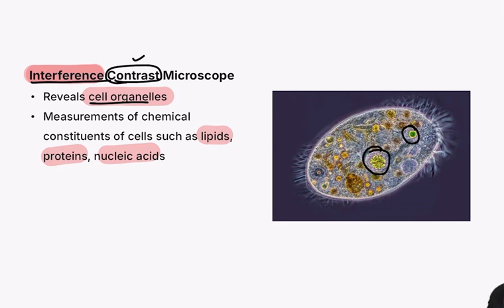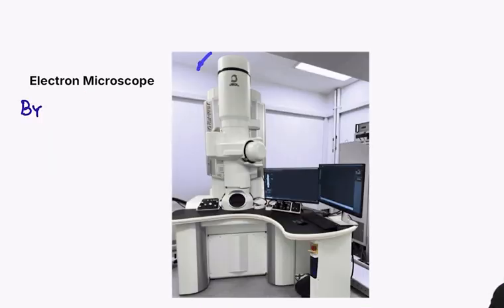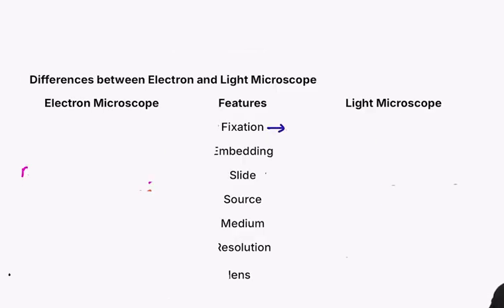Well, the last microscope that you have to do now, the one that looks like a spaceship, a rocket ready to launch because it's closed from all sides, is the electron microscope. I taught you electron microscope was E for E, that is, it was discovered by Ernst Ruska. So now what is an electron microscope? I will teach you simultaneously as I teach you the light microscope.